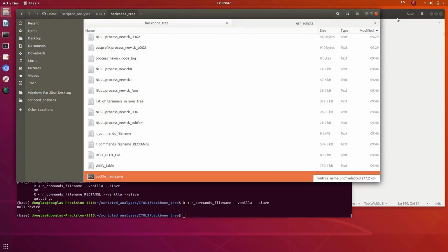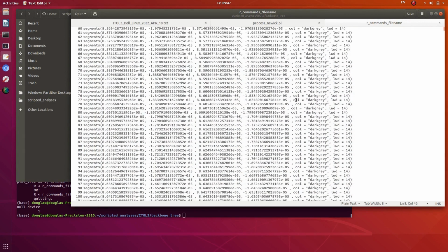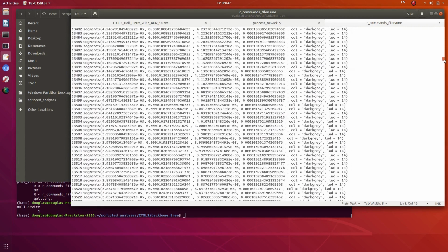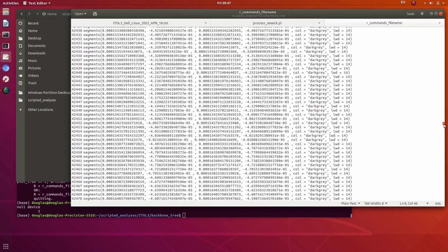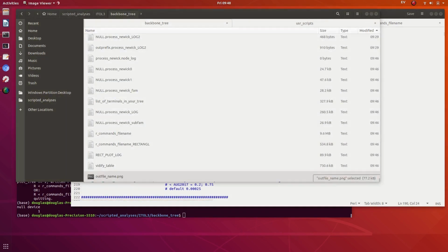Still nothing. Not sure why it's printing as such tiny values now.